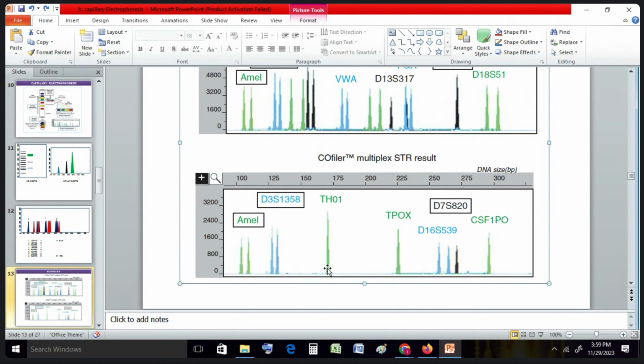যদি তুমি একটা PCR করো, if you do a PCR and you get 3 peaks for that specific locus, what does it indicate? Is it a contamination of the DNA or it is okay? It is usual, 3 peaks for an individual result? Is it okay? What do you think? Sir, I think it is contaminated.